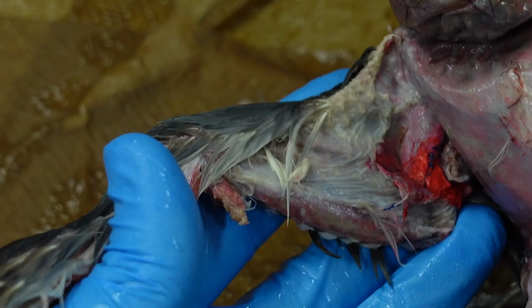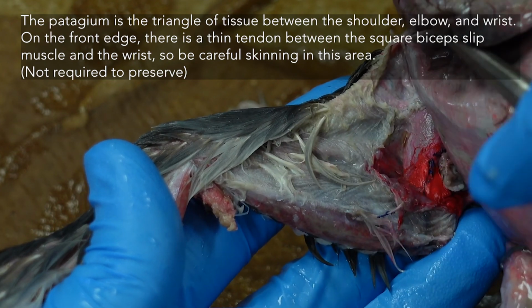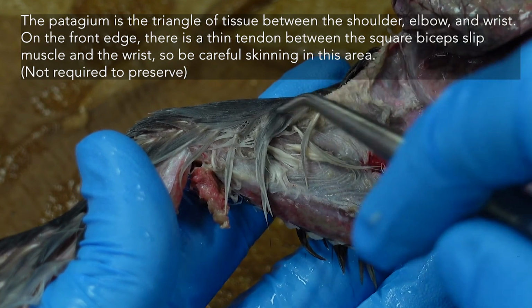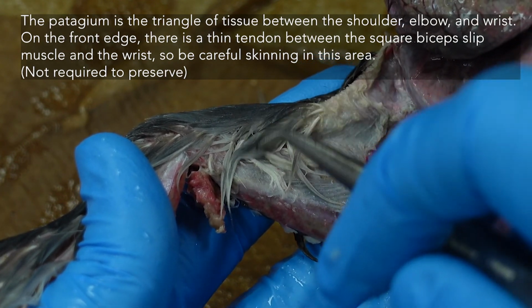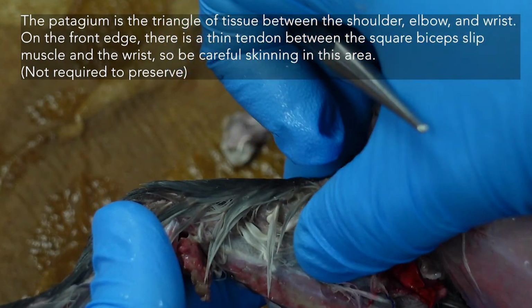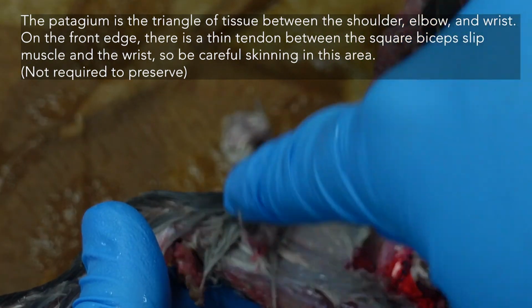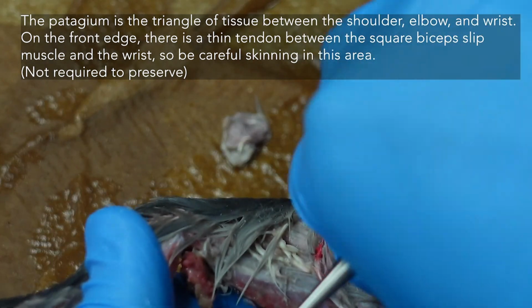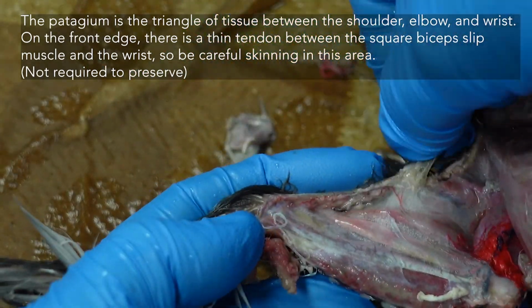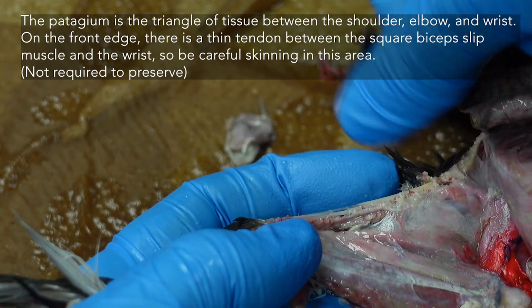As we spread the wing, there is a muscle and tendon that's spreading this triangle of tissue. Humerus is here, radius ulna is here, and we have this patagium that is stretching between your shoulder and your wrist of your bird. So this tissue is fairly tightly adhered. I would recommend working from the elbow out and up, so we're keeping an eye out for that tendon. I'm supporting that tendon as I'm pulling skin away, just to be a little bit more gentle.